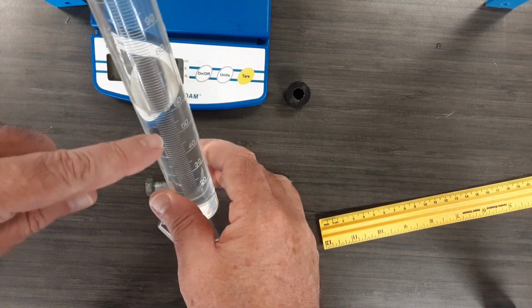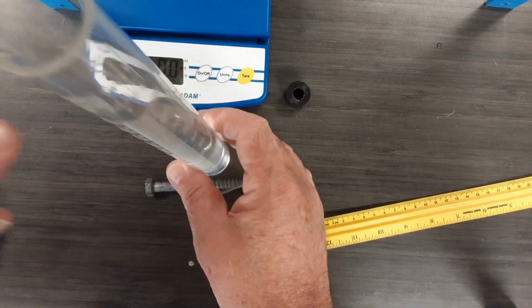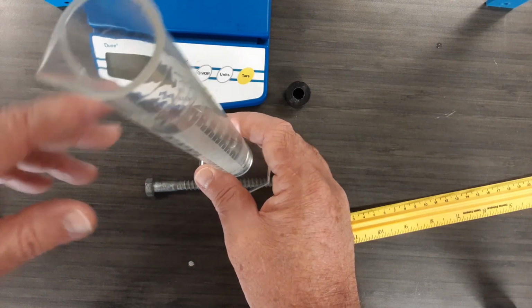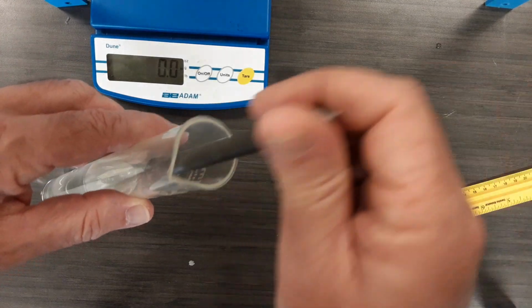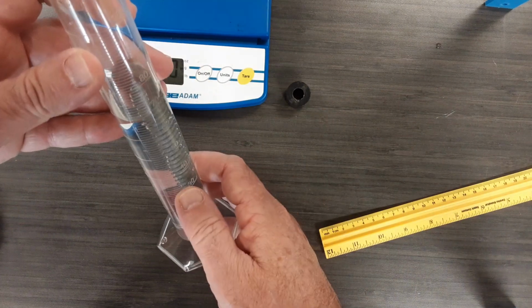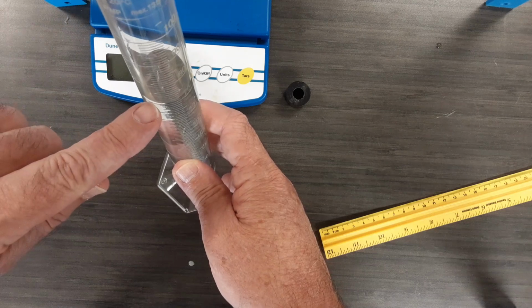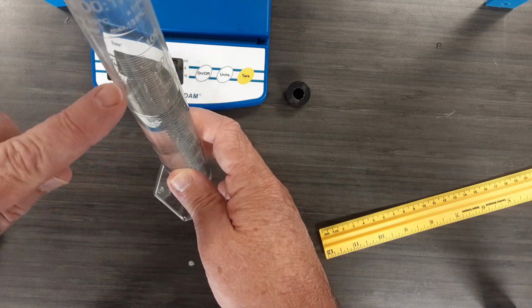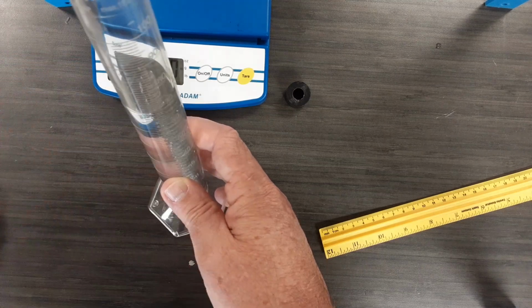One way to do this is you use a graduated cylinder. In this case, you'll probably want to put about 70 mils, it doesn't have to be exactly. And what you're going to do is very carefully, don't just drop this in, it'll crack the bottom, but slide this in. When you slide the bolt in, the water displacement moves upward. If you find the difference between the first value and the second value, the amount that the water changes is the volume of the bolt.